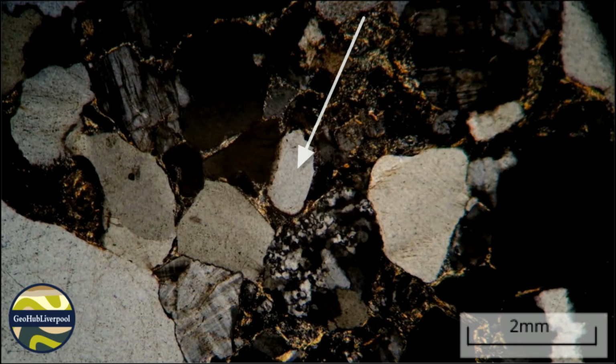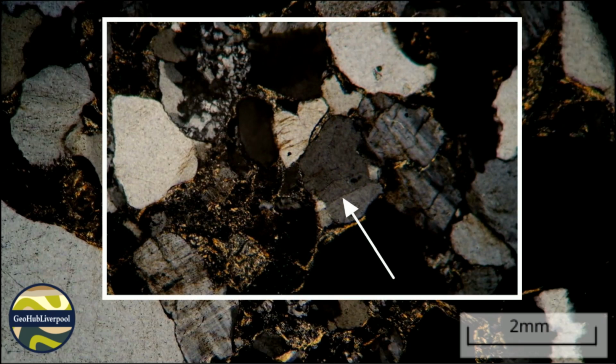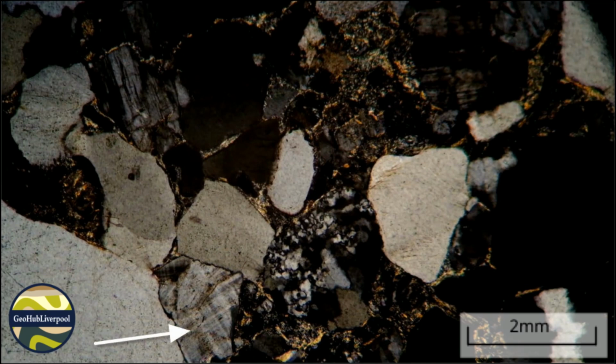Some of the quartz grains show a wavy extinction when the stage is rotated. Feldspar also shows grey and white first-order interference colours, but it is best identified by its cleavage and twinning. Some grains show simple twinning. This is orthoclase feldspar. Other feldspars show crosshatch twinning. This is an example of microcline feldspar.